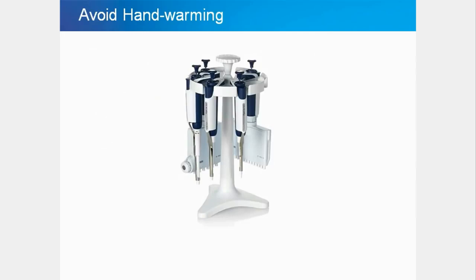Another source of error many people are not aware of are hand-warming effects. During regular use, heat is transferred from the user's hand to the body of the pipette. Prolonged handling of the pipette, such as during micro-well plate work, can result in a noticeable deviation in pipette performance. Prolonged handling of a pipette can cause a change in the delivered volume, over time, of as much as 0.5%. This is primarily due to the expansion of the air column inside the pipette from hand warming. Pipette shafts should not be handled before and during pipetting activities, since shaft hand warming effects are more pronounced.